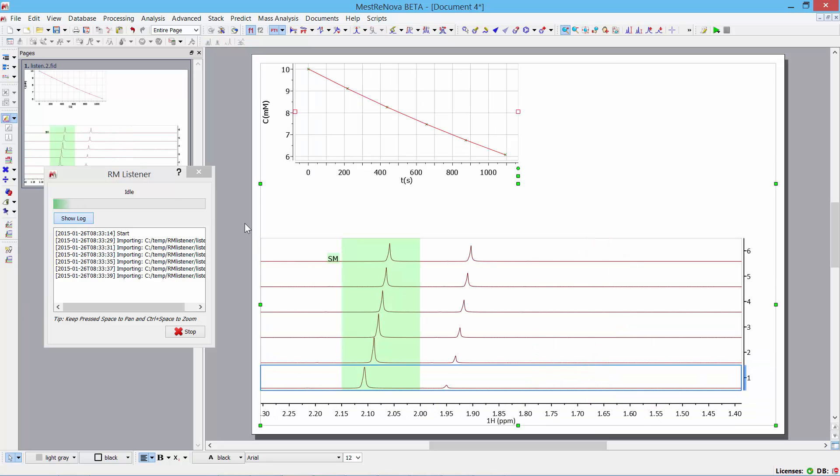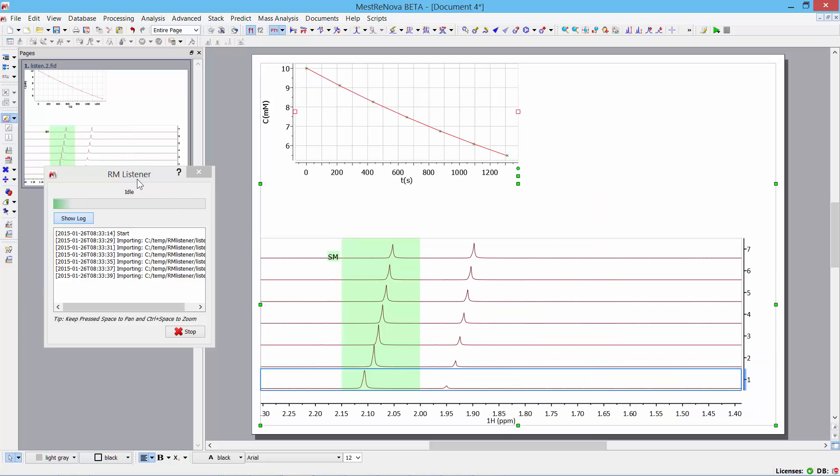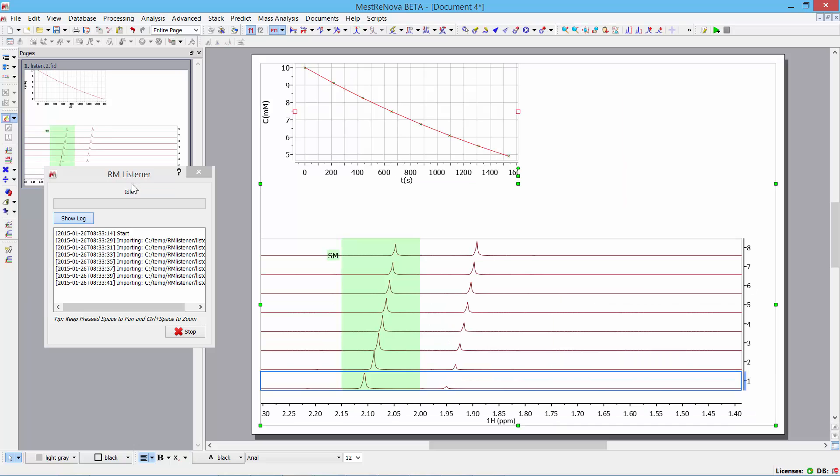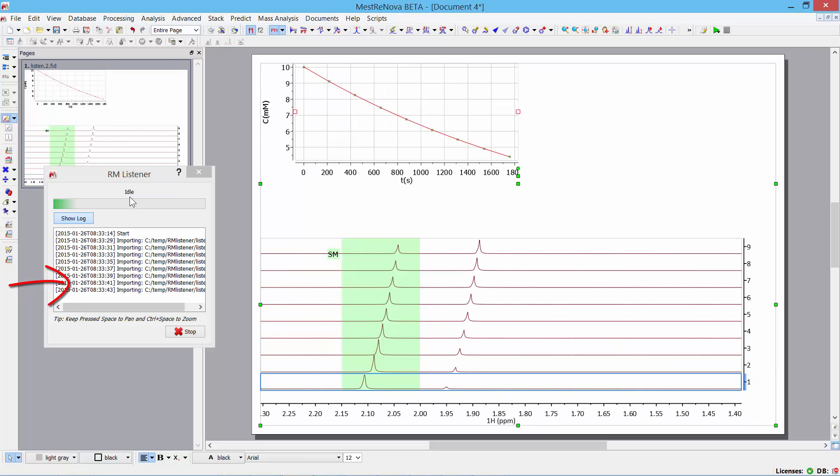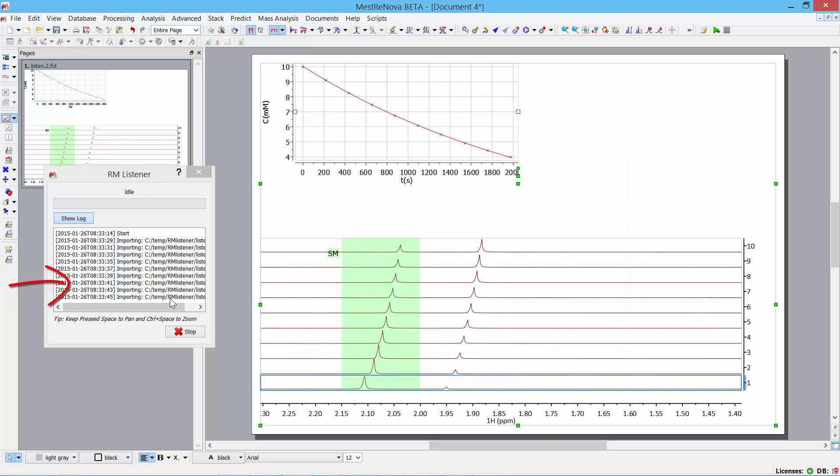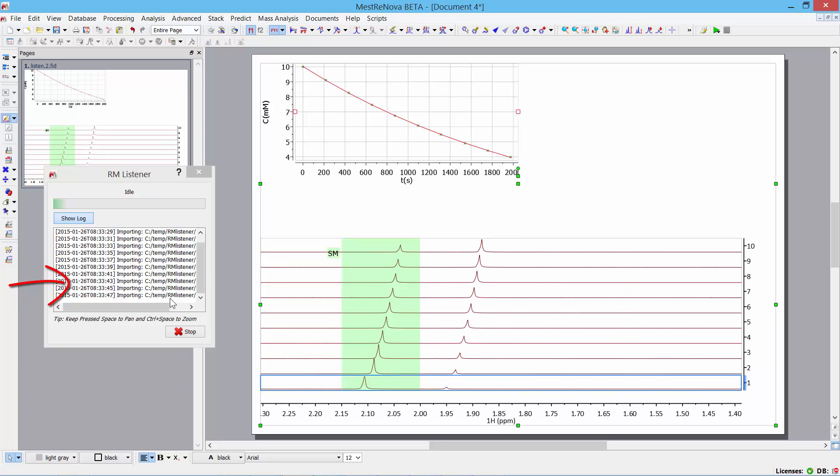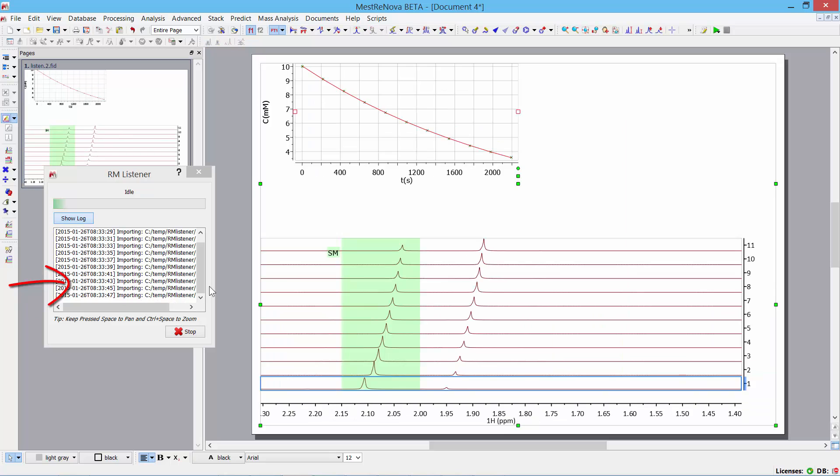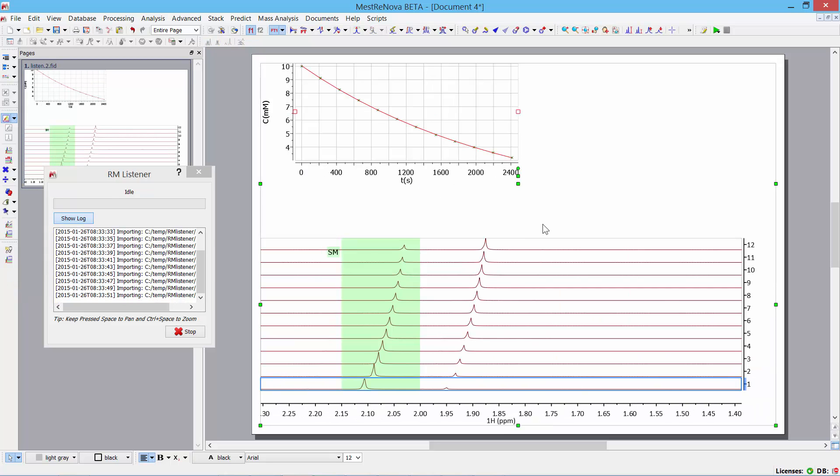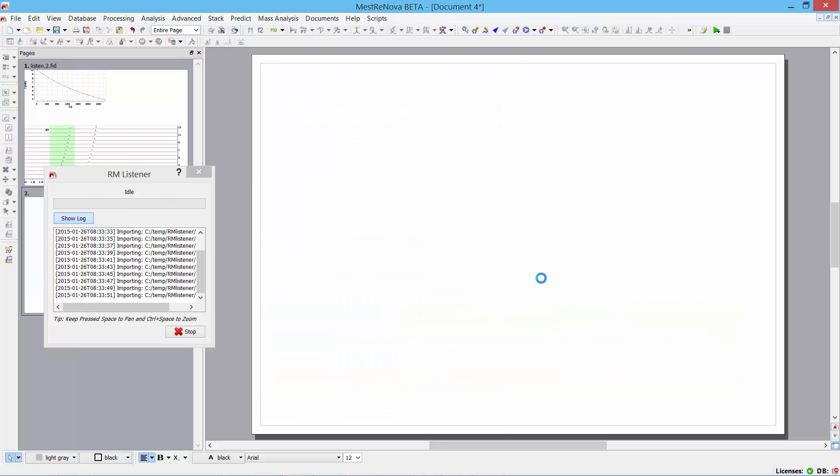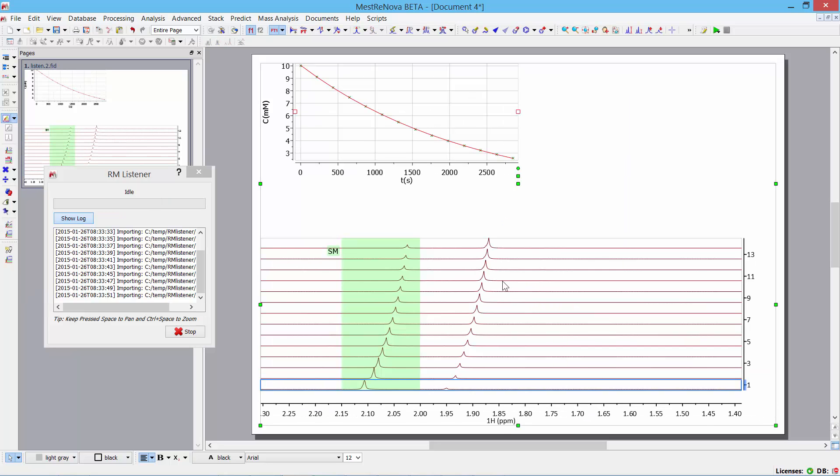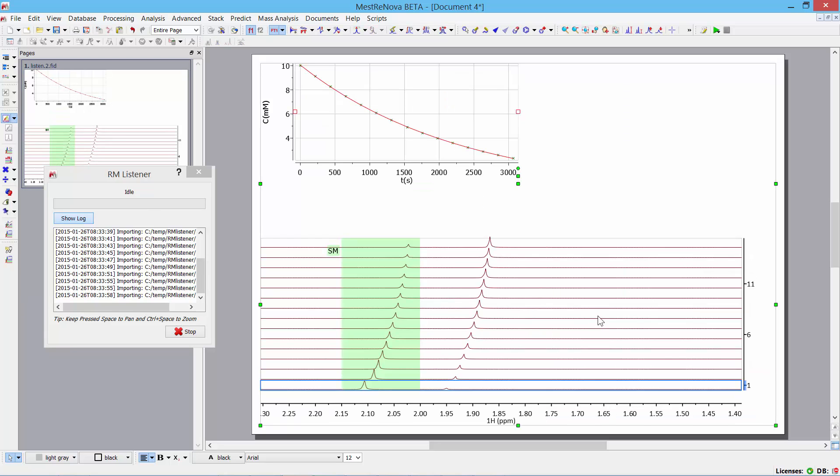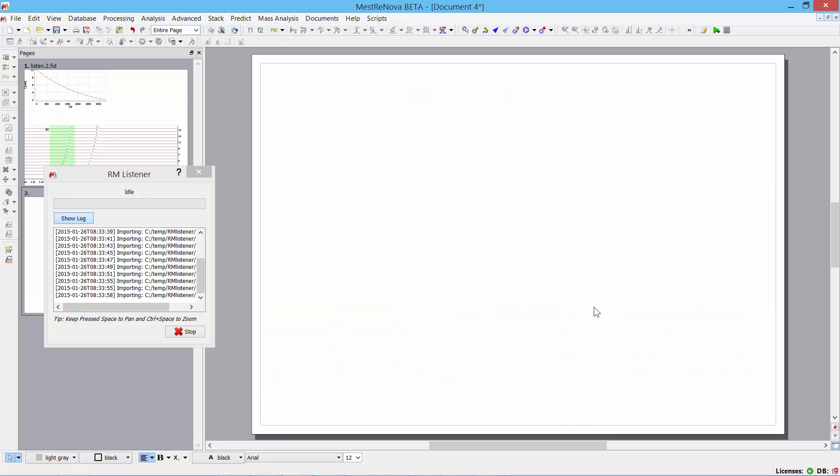And you can see what's happening is that, if you look in this reaction listener window over here, you can see the files being dropped into the folder and picked up by Mestrelab MNOVA. And what you can see on the right-hand side in the main screen is that the graph is being updated with each spectrum appearing every couple of seconds.